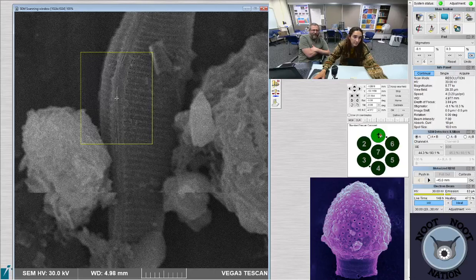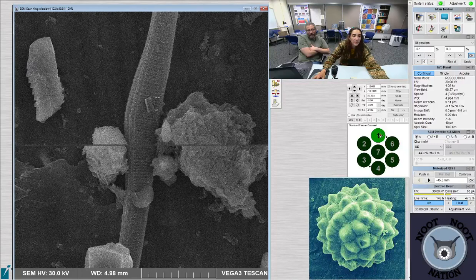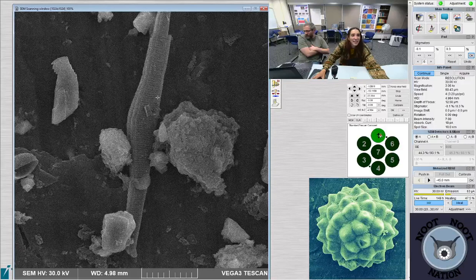It's Epithemia gibba again. Mm-hmm. It's just this one is all alone. Yeah, it's nice. It's not at a weird angle either. Nerds love science anyway.